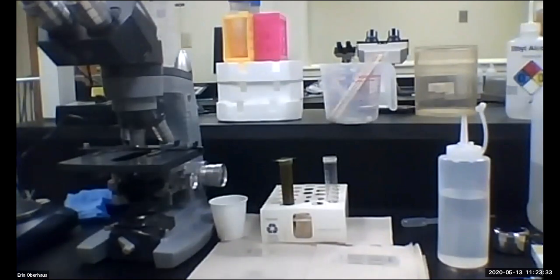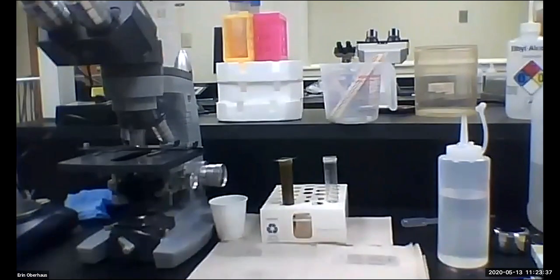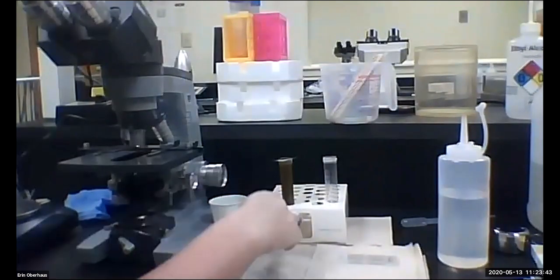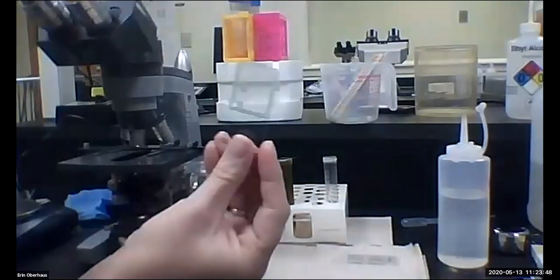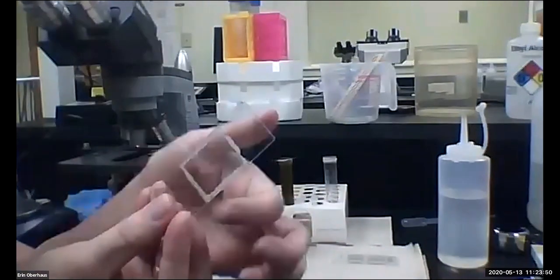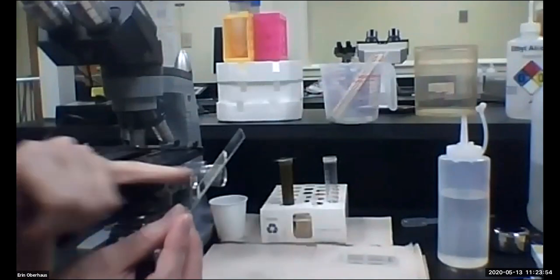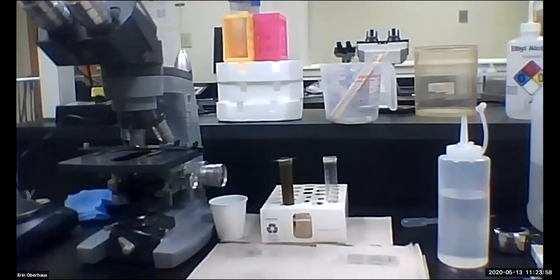If you're working with a salt solution, the longer you let it sit, the more it crystallizes, and it can begin to interfere with your visual field, making it difficult to observe the parasite egg. So you don't want to let it sit too long. I left one sip this morning just to show you all those crusties along the side. That's also occurring under the cover slip, and it's going to make it very difficult to visualize.